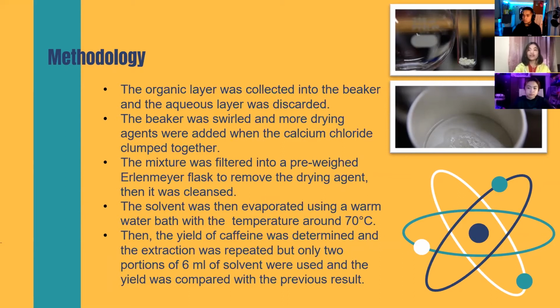Then the yield of caffeine was determined. The extraction was repeated, but only two portions of 6 ml of solvent were used, and the yield was compared with the previous result.